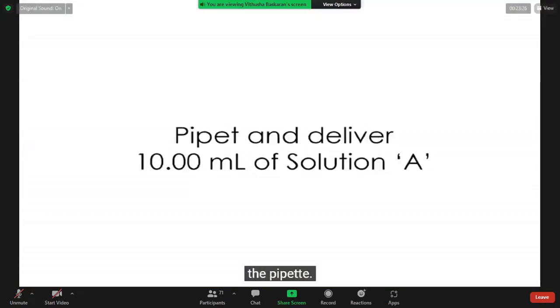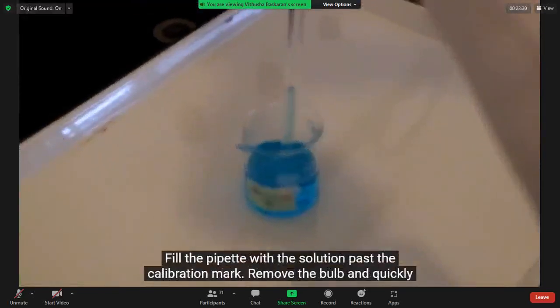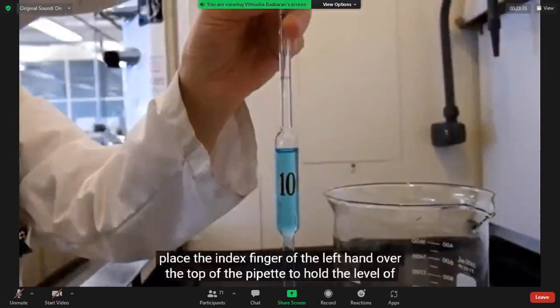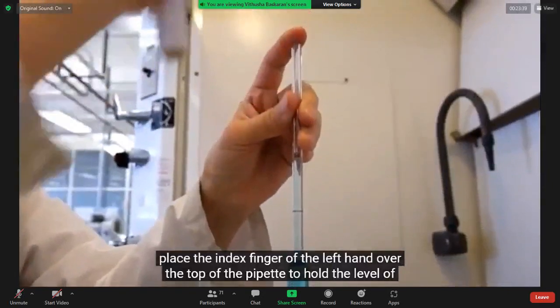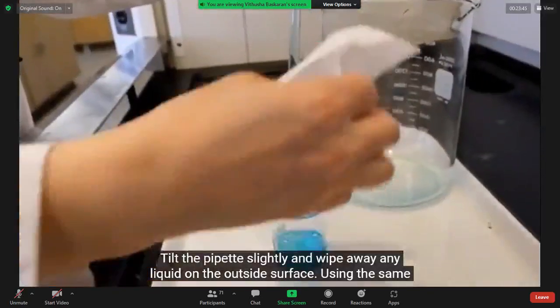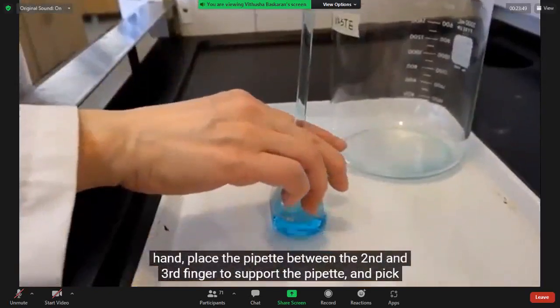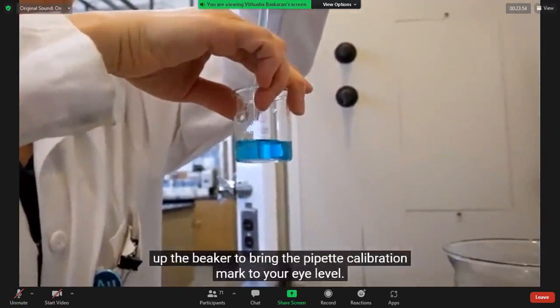Pipette and deliver 10.00 mL of solution A. Fill the pipette with the solution past the calibration mark. Remove the bulb and quickly place the index finger of the left hand over the top of the pipette to hold the level of the solution. Tilt the pipette slightly and wipe away any liquid on the outside surface. Using the same hand, place the pipette between the second and third finger to support the pipette and pick up the beaker to bring the pipette calibration mark to your eye level.